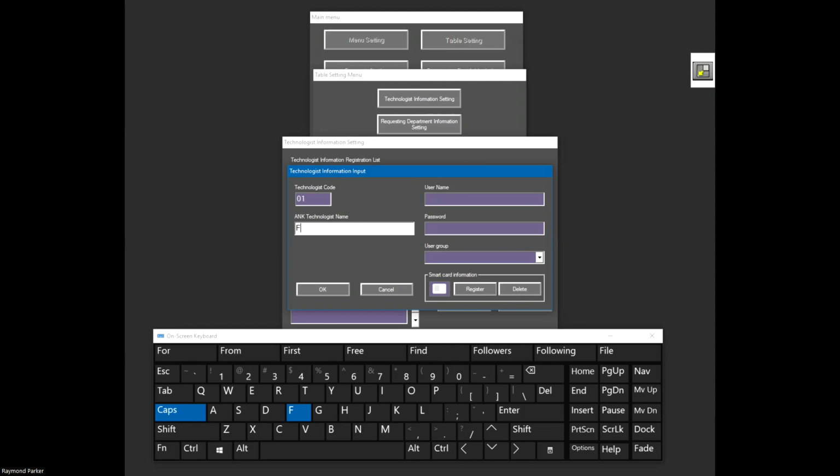In this one, I'm going to give them the most generic possible username and password, which is what you'll see most often at sites. They want it simple, but they just want to exclude their general users from certain functions such as delete. And then they also want a link to the technologist or super user.